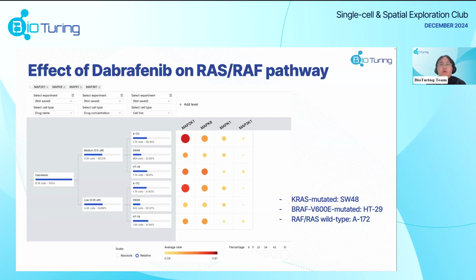In here, there's also one interesting thing we saw, that the doses of this drug don't really affect the expression that much. And that's also one thing we can see from the original figure in the paper, that even with different doses, high, low, or medium, the effect didn't change much. So that's just one thing we noticed for now. That's about the composition chart.